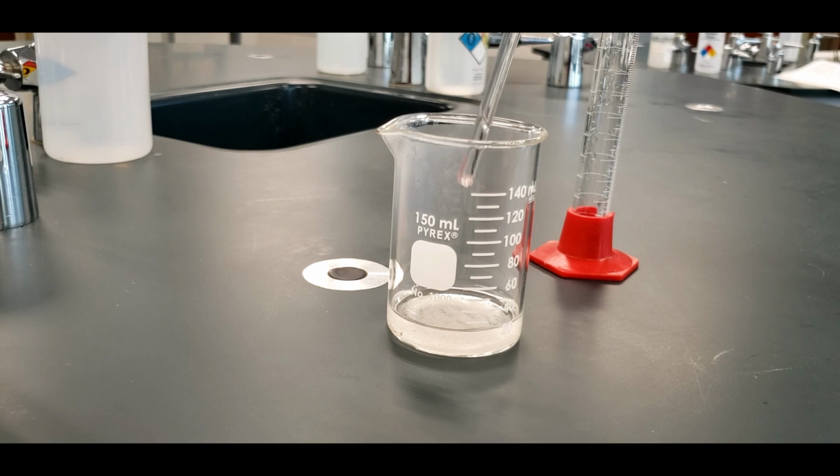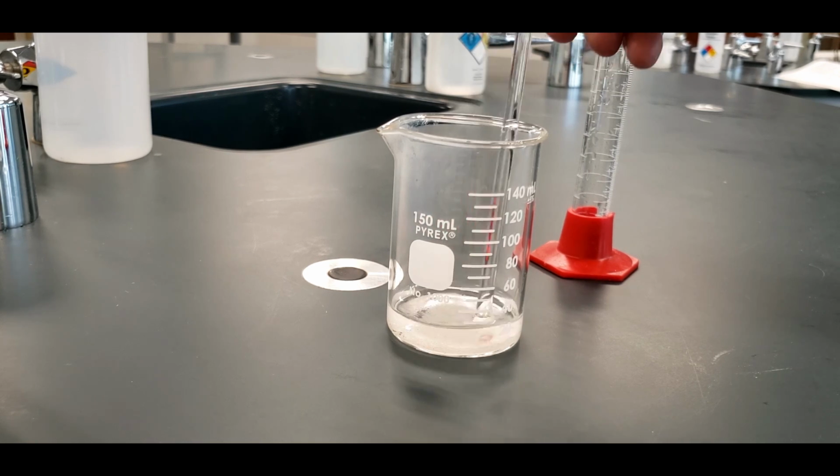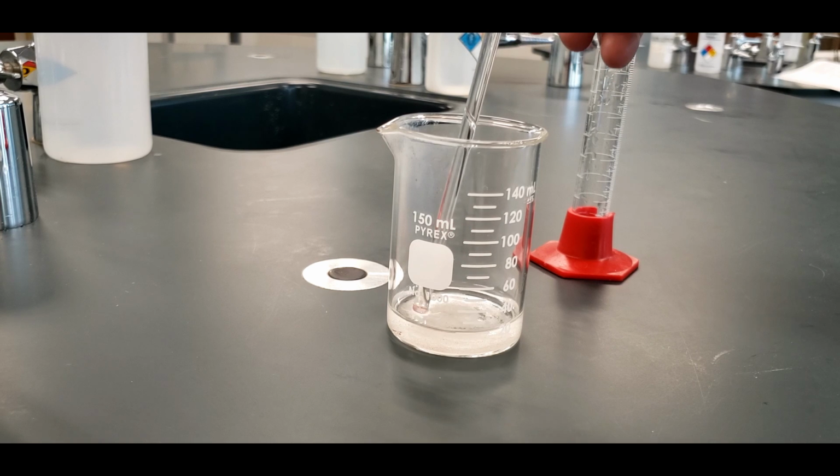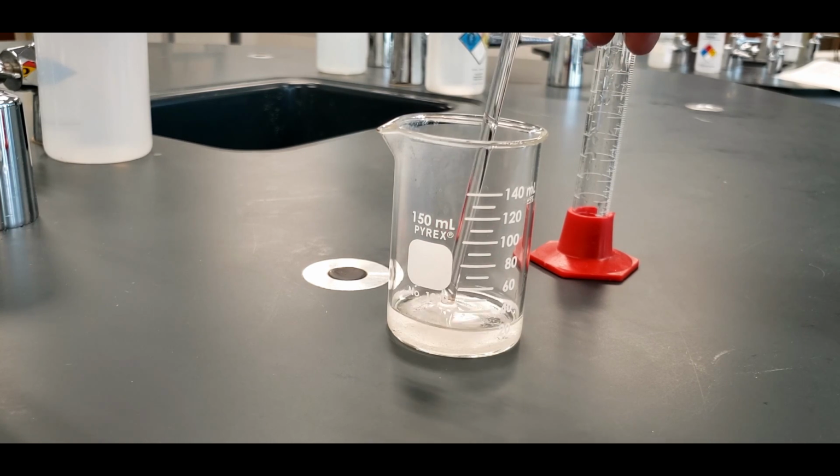So I added the 15 mils of water. I had the camera on for that, but then I messed up. I knocked the camera. So we'll just start from here. What we have is the salt and sand in the beaker. Now with 15 mils of water, that's going to dissolve the salt and leave the sand behind. Now I'm supposed to stir this for 3 minutes, so I will. I won't make you watch, so let me do that.